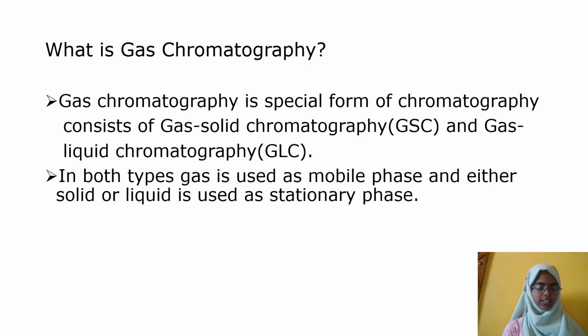What is gas chromatography? Gas chromatography is a special form of chromatography. It consists of gas solid chromatography, GSC, and gas liquid chromatography, GLC. It has two types: one is gas solid chromatography and another one is gas liquid chromatography.